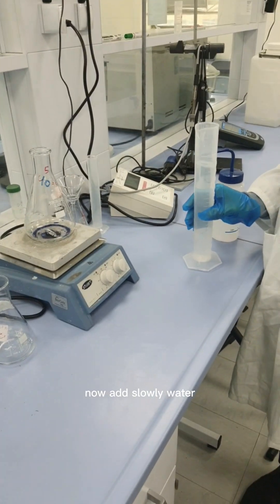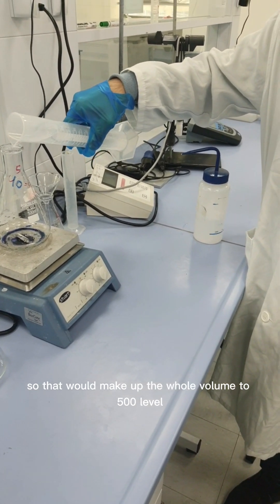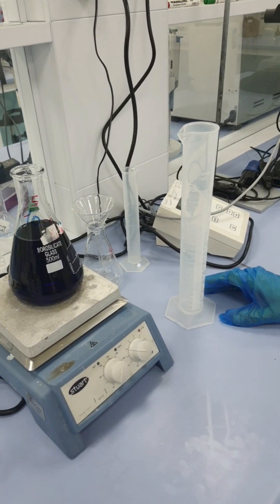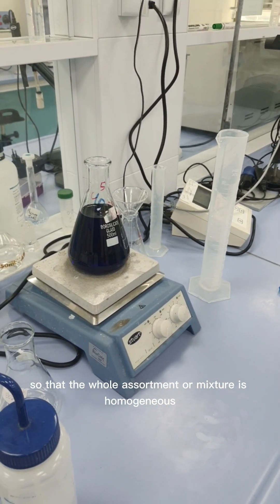Now slowly add water — this is around 250 mL — so you have to add another 250 mL to make up the whole volume to 500 mL. Switch on the stirrer slowly. We will wait for around half an hour to one hour so that the whole mixture is homogeneous.